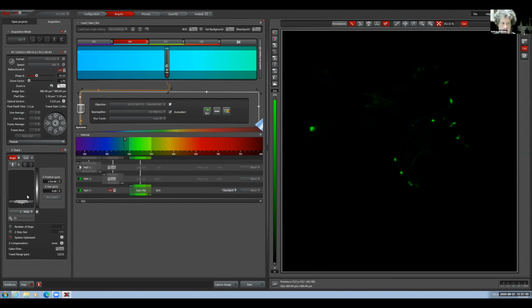Right. Which on an inverted system isn't as dangerous, because the slide will just pop up. Pops it up, right. The other way, it just crushes it, and then you're doomed. And I have had people crush it on remote. I have seen remote systems crush slides on uprights. Inverteds are very much safer.